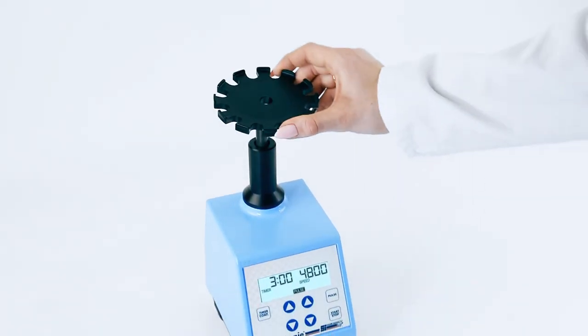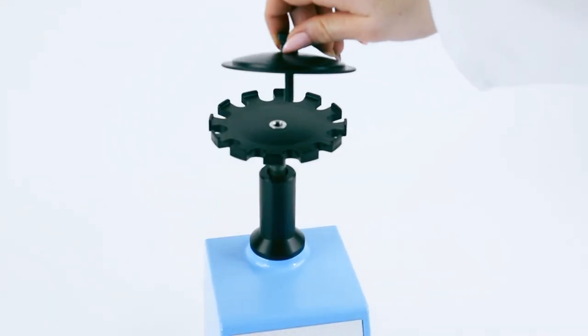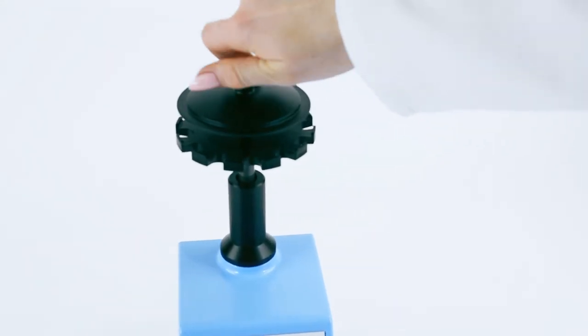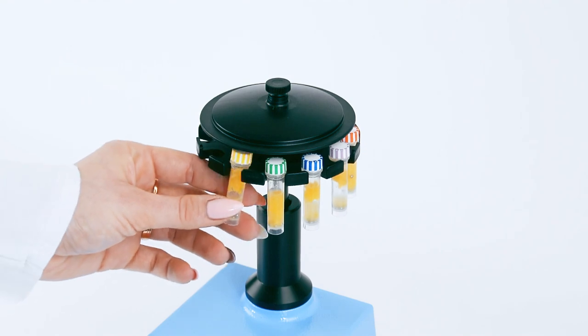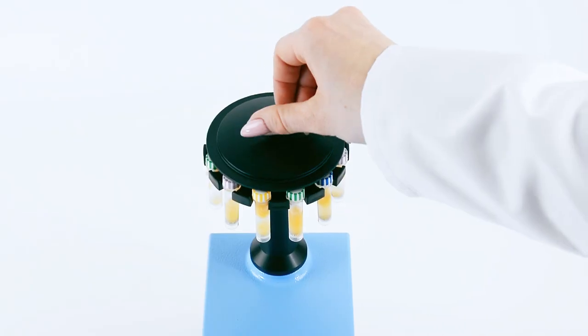Setup is effortless, and there are no tools required. Simply insert the tube holder of your choice, load the tubes with your sample and beads, and secure it with the clamping disc.